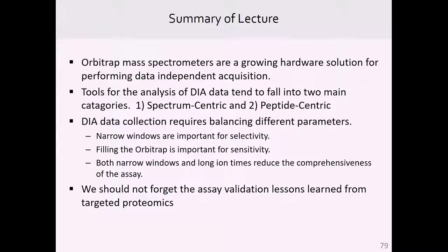I have a question on your spectral library generation that you just mentioned in one of the last slides. Do you have any numbers, where is a critical threshold? It's not really a strict threshold, I guess, where you blow up the library in a way that you have negative effects. And what would you recommend with respect to generating libraries on cell sources that you would like to feed in?